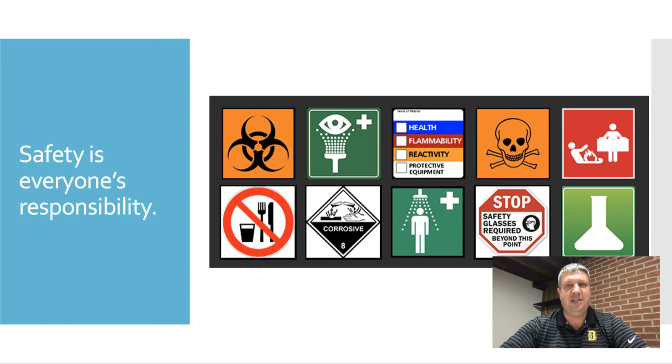There are physical hazards, there are biological hazards, there are fire hazards. But when it comes down to safety, it's everybody's responsibility. It's yours, it's mine, it's your family's, it's even Mr. Guerra's. If we're working in the chemistry lab and Mr. Guerra comes walking in, he does that from time to time, he just pokes his head in because he's curious to see what's going on. We need to make sure he is safe in lab.